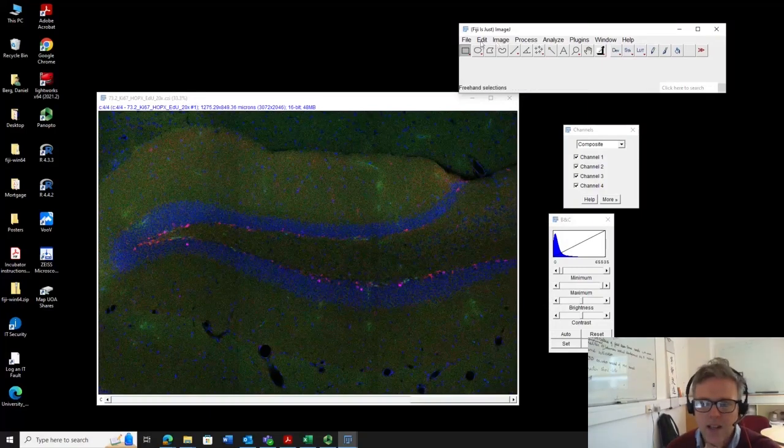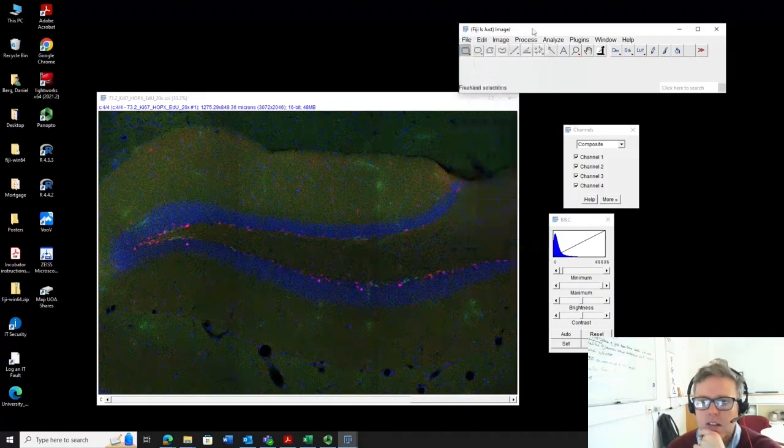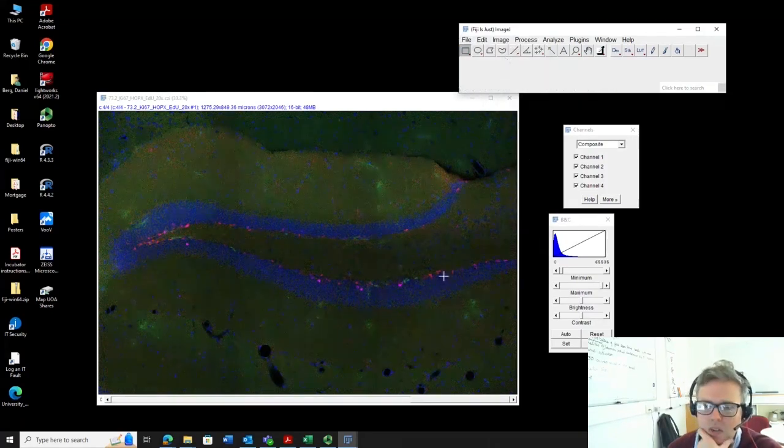And that's about it for this first video, and just learning how to open images and do some easy counting in ImageJ.